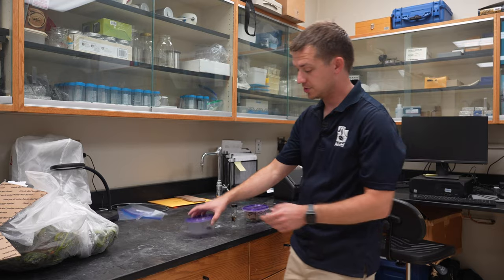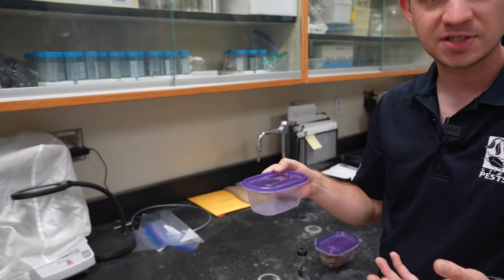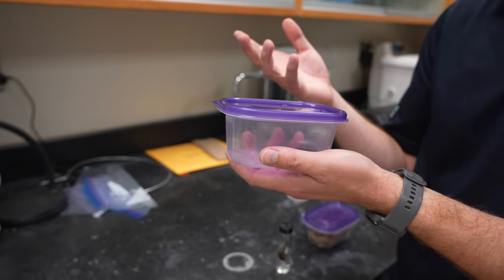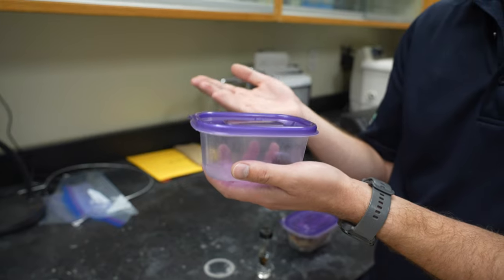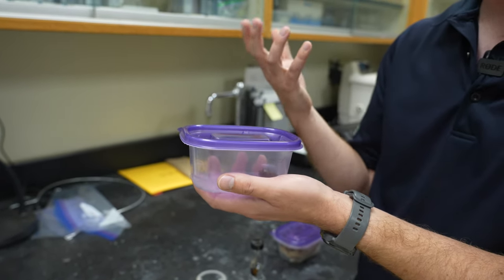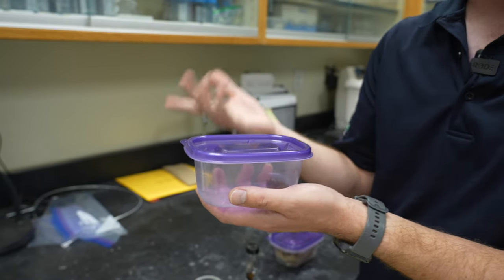For insect samples, we need to make sure the insect is sent to us in a safe manner so it doesn't arrive completely damaged. If an insect arrives damaged, it's really hard to get a diagnosis or identification. That is because when we put insects under the microscope, we often need to look at microscopic features such as hairs or their feet — what we call tarsi.